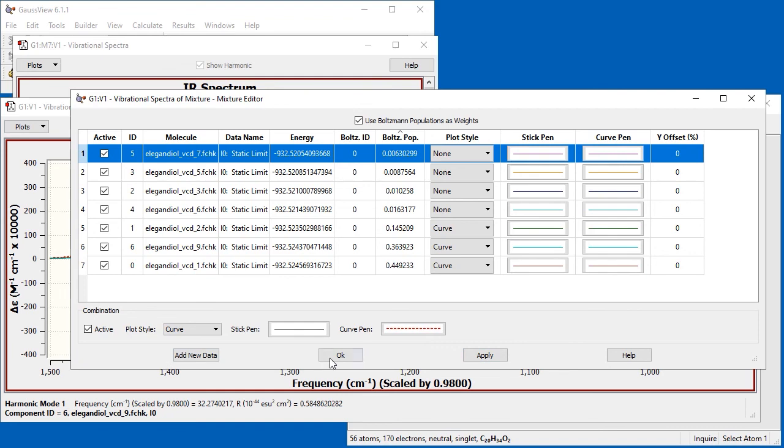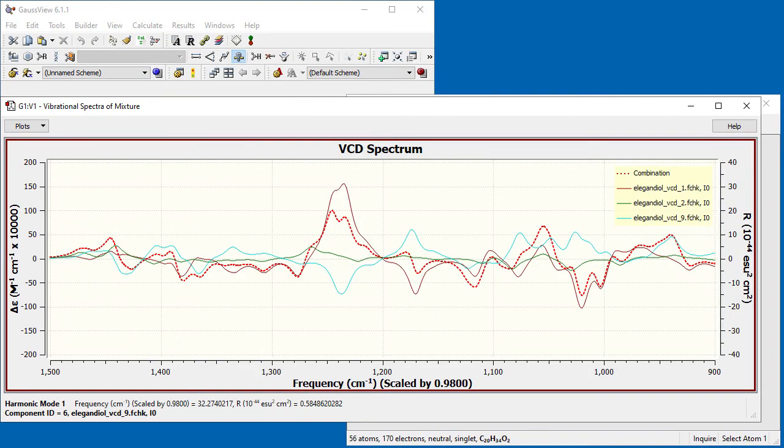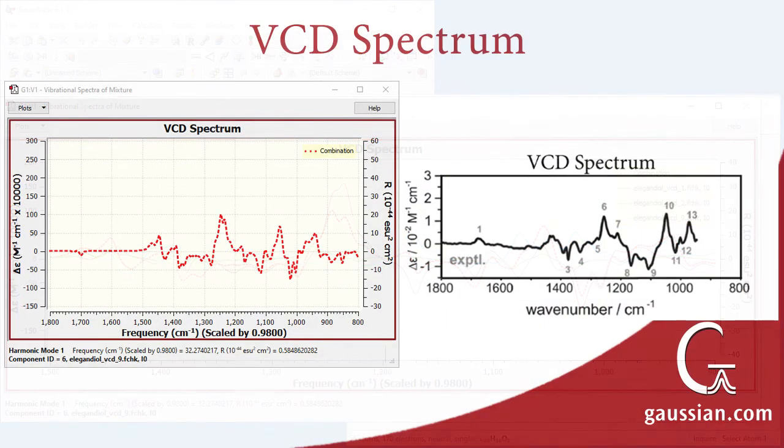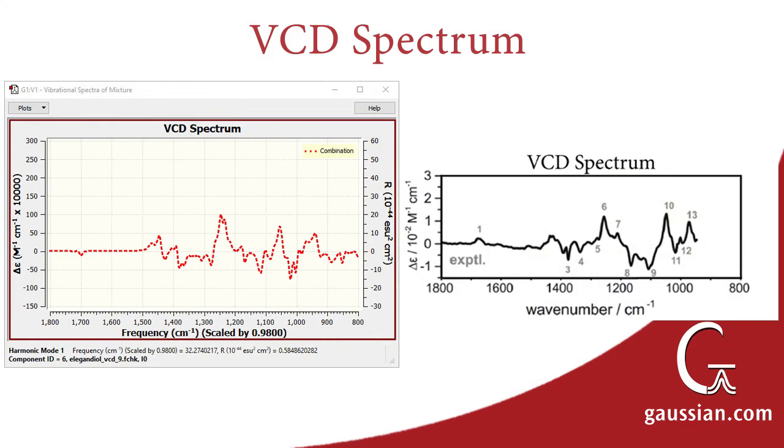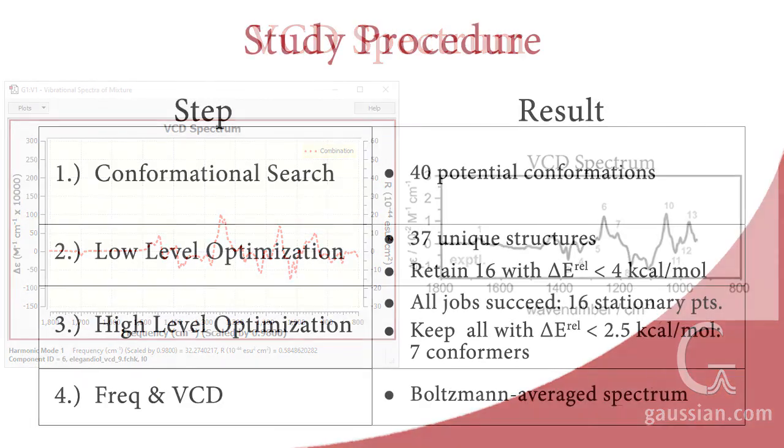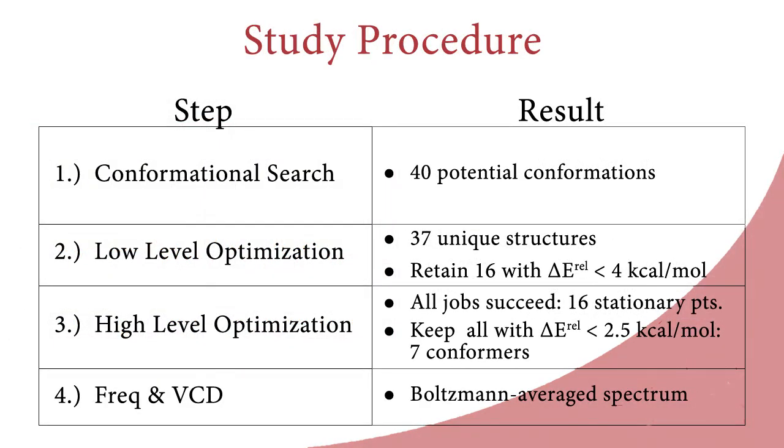Here is the resulting display. The Combination spectrum generally follows that of the lowest-energy conformation, with adjustments coming from other conformations. We can now compare our predicted spectra to the experimental data. There is reasonable agreement between the two. Here is a summary of our complete study.